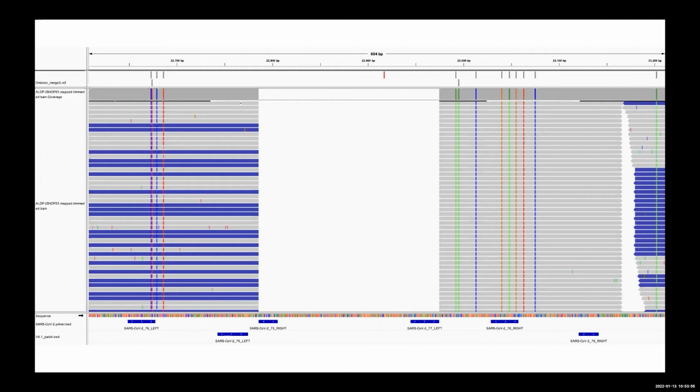These will cause the primers to fail because we've got these 2-3 mutations here on the left primer towards the 3' end, which we know is important for stability and amplification efficiency. And we've got 3 mutations within the binding site here, which are going to reduce the annealing efficiency on the reverse primer. So we know this is going to cause dropouts, which it does because you can see we've got no sequence here, and we had to rapidly address this. This is an important part of the S gene. It contains 3 mutations that people are interested in monitoring.